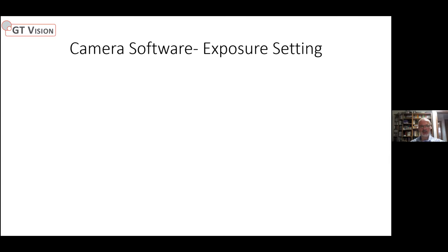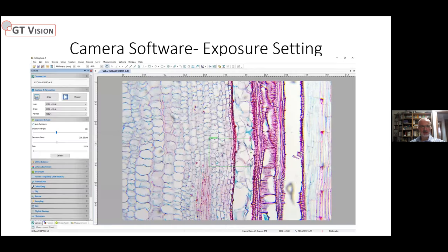Let's look at some camera software features. One key thing is setting the exposure — you can set it to auto-exposure, with a green square defining the target area, and the software optimizes the image. Or you can turn auto-exposure off and set the exposure time manually. You can also change the resolution — reducing resolution gives a faster frame rate. The software, which comes free with the camera, offers a huge range of options to optimize and adjust the image.